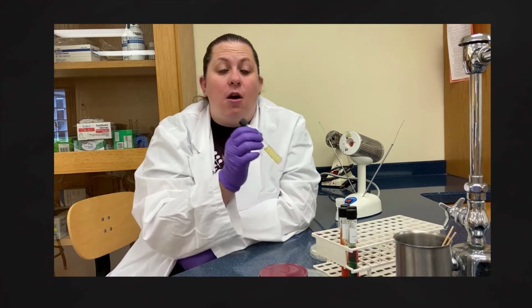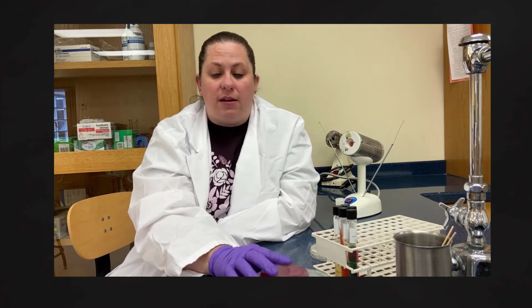And a lot of these are going to be used for other tests, specifically for gram-negative bacteria, which we'll talk a little bit more about in later videos. So let's go ahead and look at our streak technique.